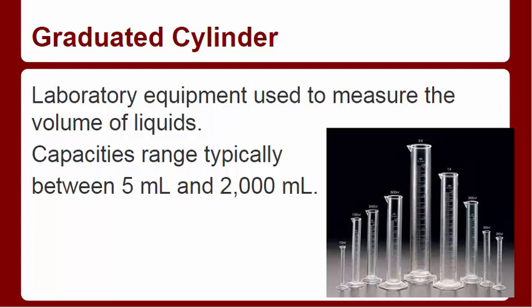This is our video on how to measure liquids using a graduated cylinder. You've looked at graduated cylinders already in your lab drawers, and they look like this picture here. It's laboratory equipment that's used to measure the volume of liquids.